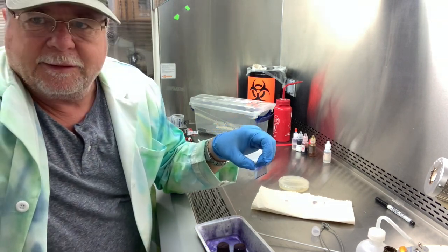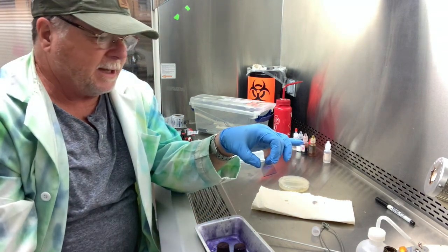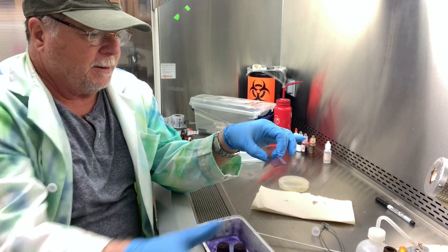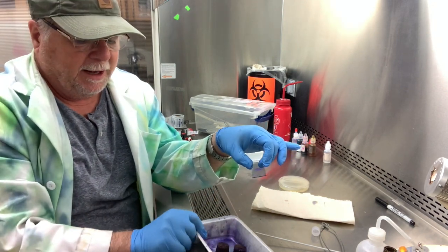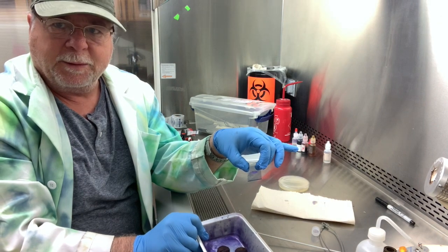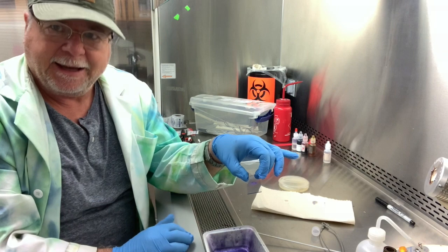Just a reminder, once we're done staining, we can wipe it down and put everything away. The stain can just be rinsed down the drain with lots of water, and then everything goes back into your stain kit.